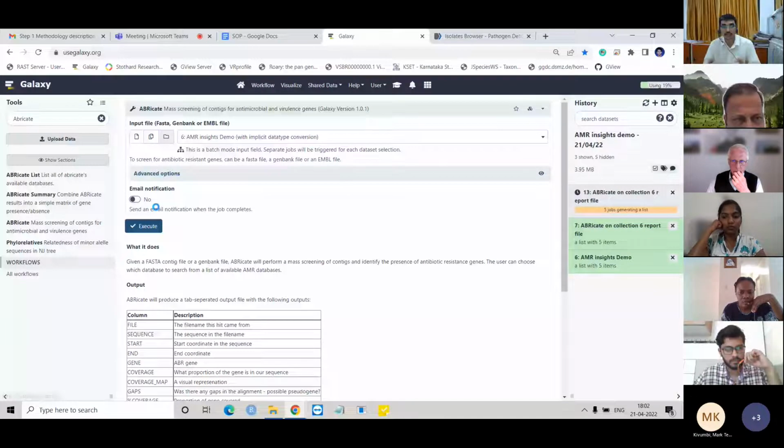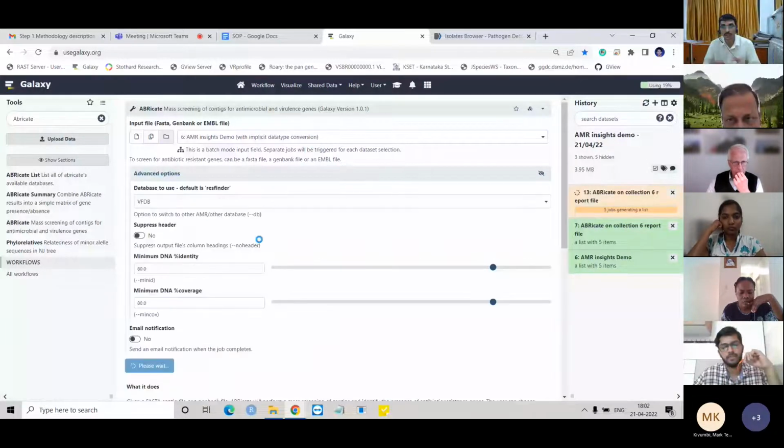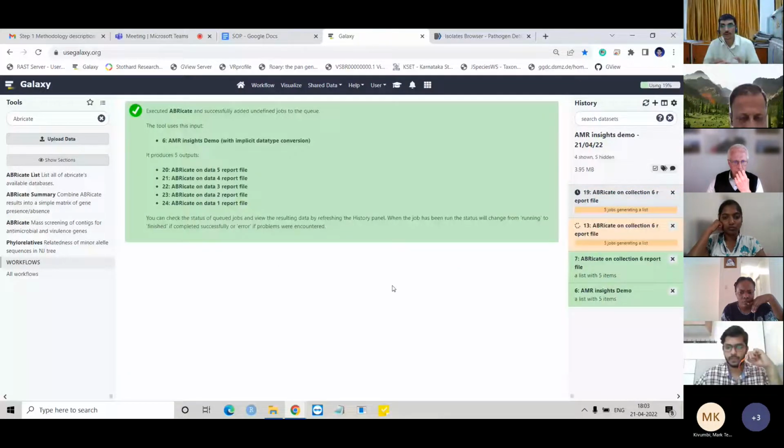And the third one we will be using is the VFDB database, called the Virulence Factor Database, through which we will be mining different virulence genes in these particular pathogens. So these three databases are really helpful to answer the different research questions that we have asked.